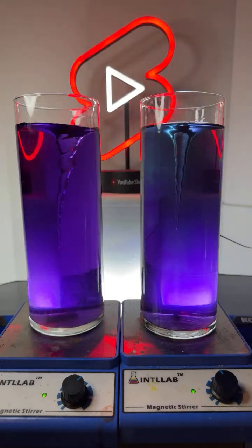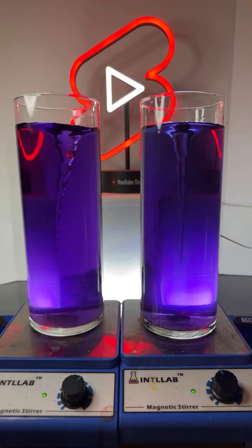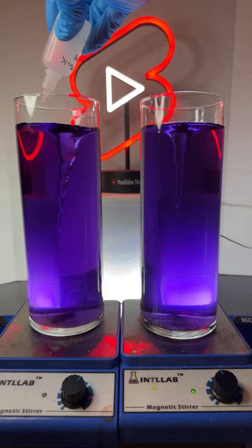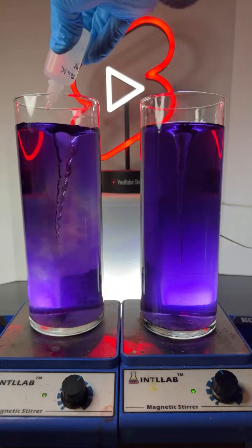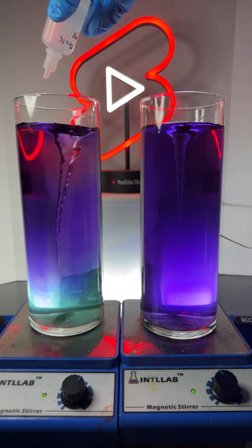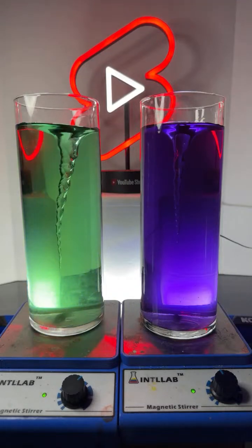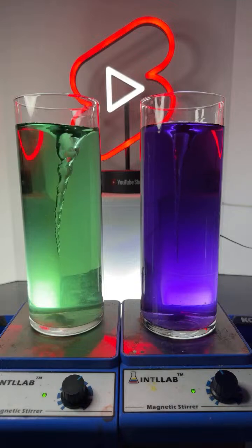Now we'll try adding some. Hello there, Hollywood. We're gonna try some hydrochloric acid over here on the left. And let's cut those room lights off there, Jake. I got my son here, Jacob, with me. That make a difference? You can see a little bit of what is that, refraction over there on the left-hand side from the YouTube sign.